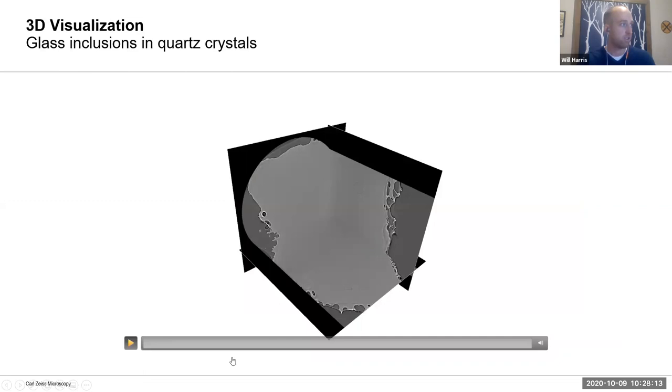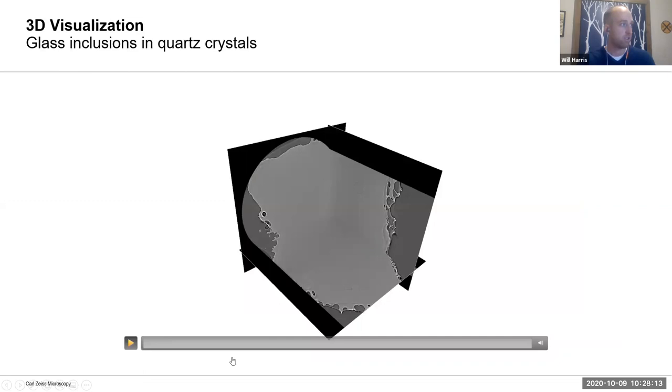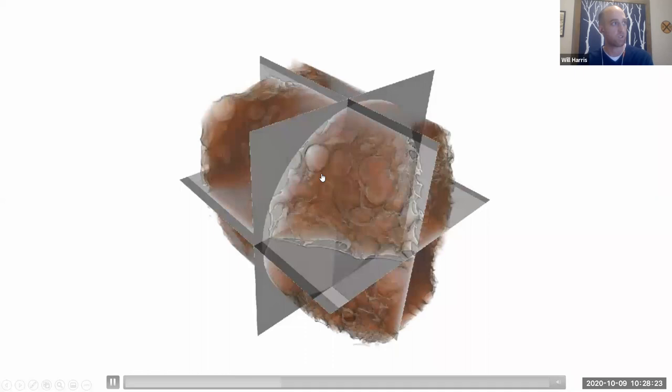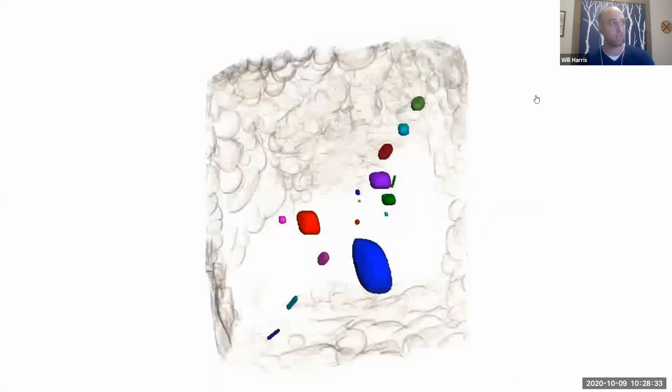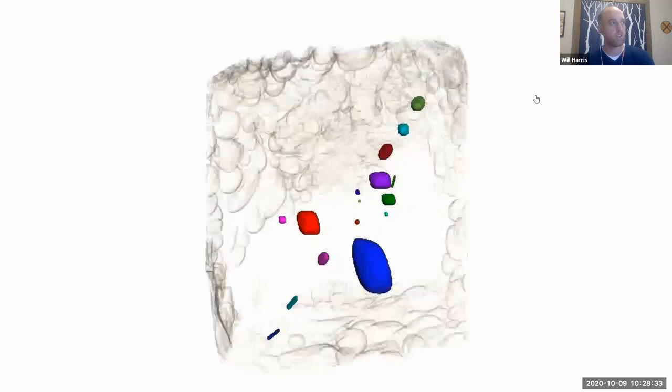A short video showing results of a phase contrast scan where, as we go through, you'll see some little glass inclusions that exist within the core structure. That really helps with what you usually want to do as a next step in image processing — it makes it easier to do segmentation and subsequent quantification of your objects.